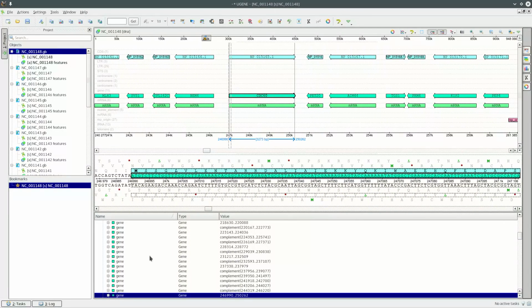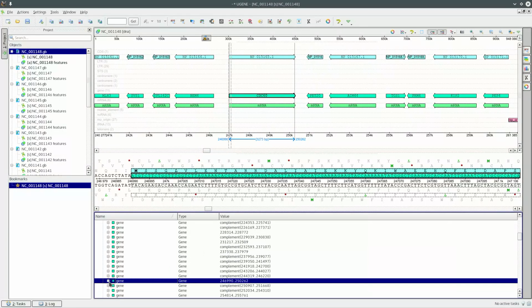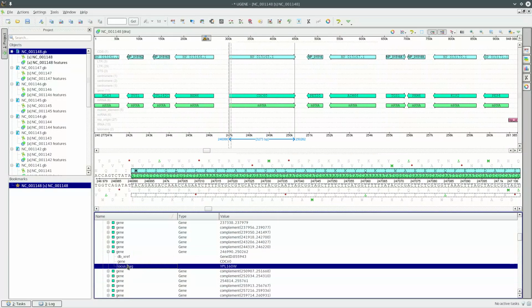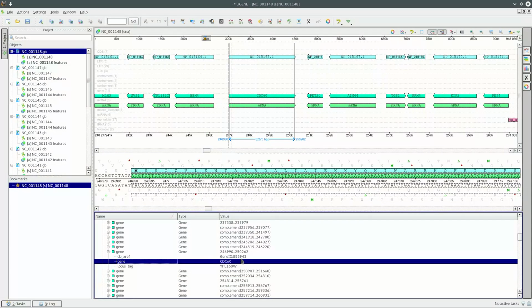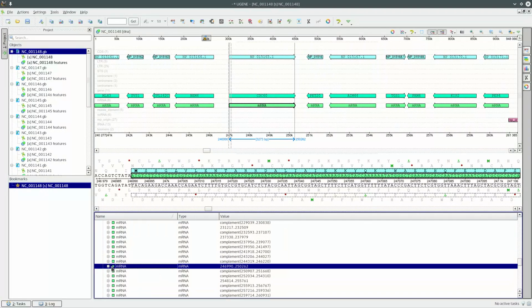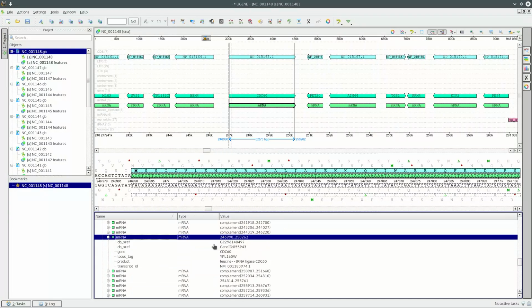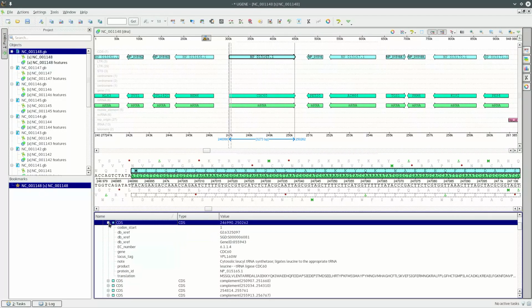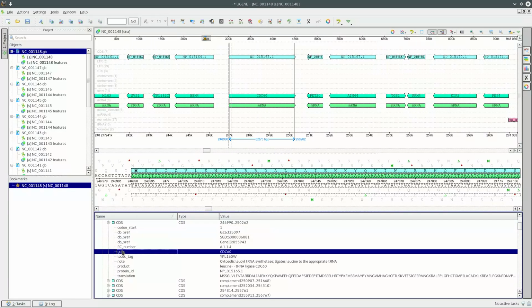The bottom window contains all of the metadata in that tag. So it's highlighted the CDC60 metadata, and you can see that that's the locus tag, that's the gene for CDC60. I can click on the mRNA annotation, and it'll jump down to the mRNA annotation down here, and you can see all the information that's inside that one. And the most information is contained in the CDS metadata. Click on the CDS for CDC60, and it gives you the gene name it's associated with.